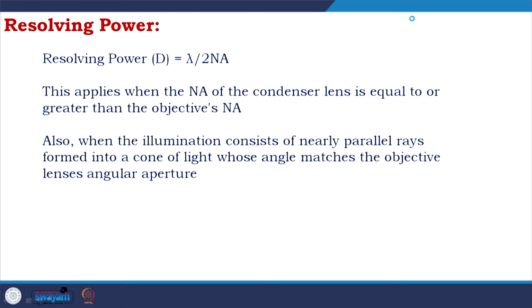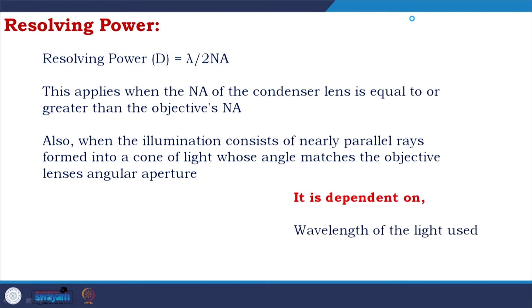So, the resolving power depends on the wavelength of the light used and the numerical aperture of the lens.